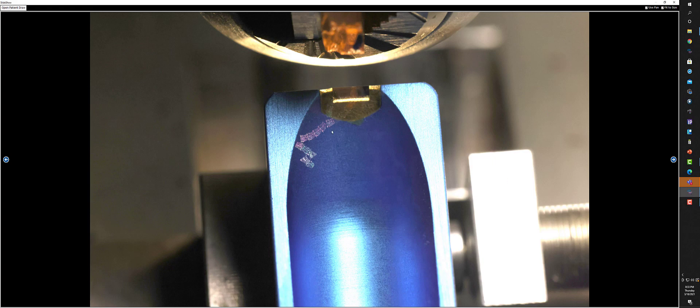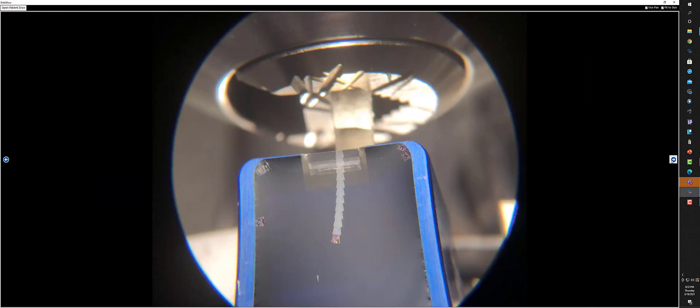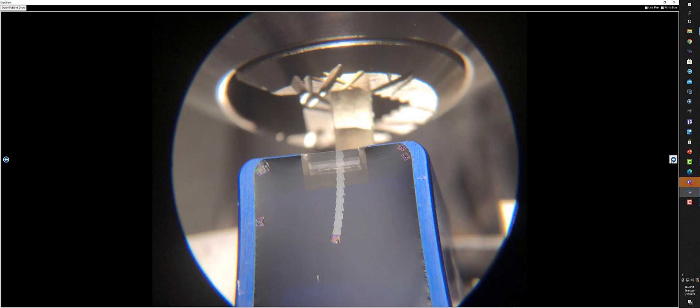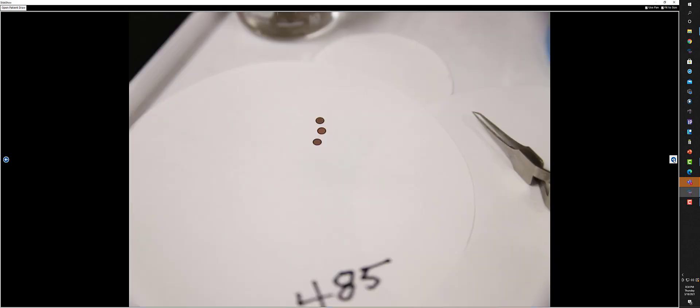You want silver gray sections, which are about 70 nanometers. But there's what you want. These are silver gray, 70 to 80 nanometers thick. The technique is pretty much the same. You have to break these apart with an eyelash very carefully, and you tease these around. Then you go in with a loop. You take out your copper disk. These are called grids.